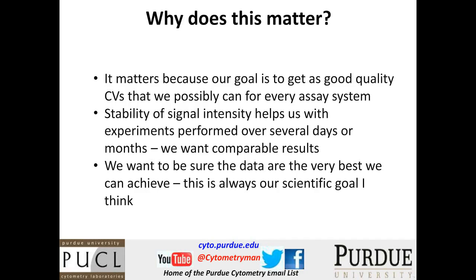And the stability of the signal intensity certainly makes it important for experiments performed over days or months. You want to compare results. You certainly want to know that the data are compatible from one day to another, or comparable, which is probably a more accurate way of saying it.